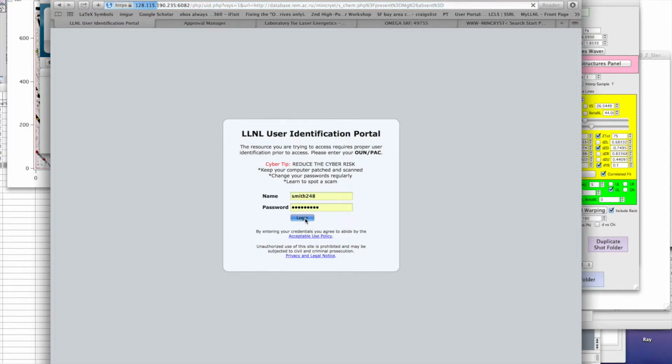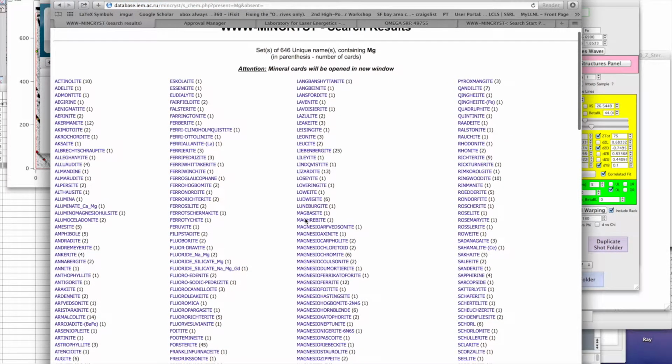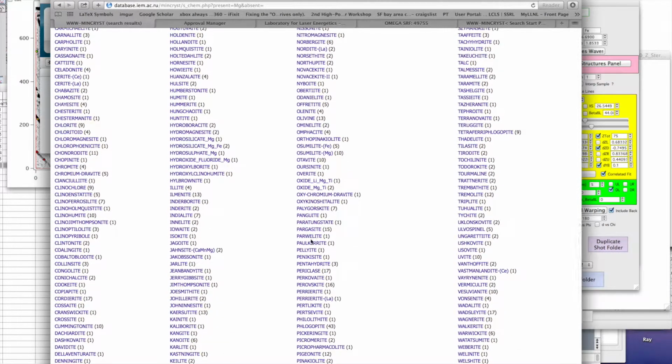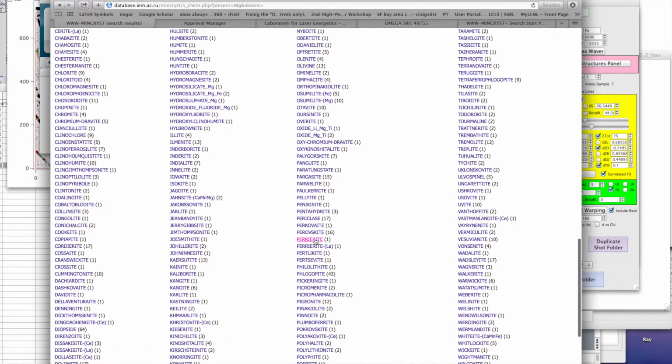Okay. And I look for the periclase. Oh, periclase, yeah. That was what we were talking about the other day. MgO.